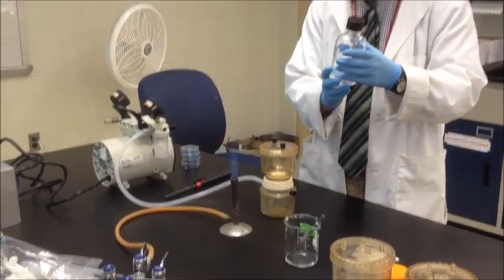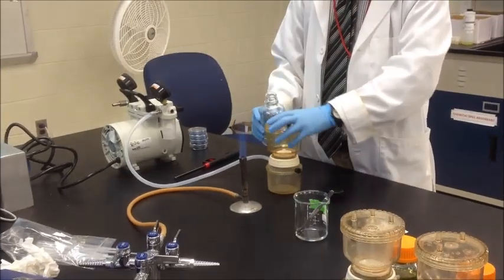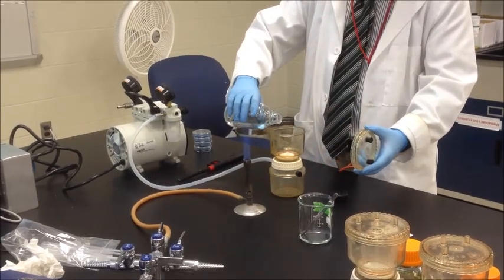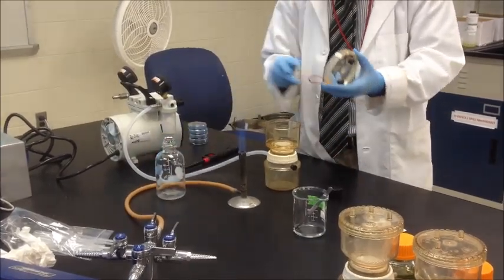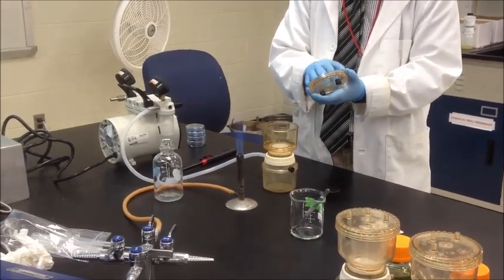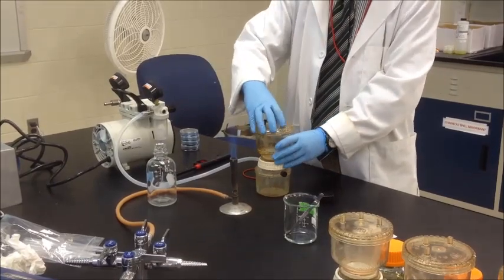And then I'm going to take my water source. This water is sterile water, so it should not contain any bacteria. This will be my negative control. I'm going to open up the container and pour in the water. You're going to be pouring in approximately 100 mLs, depending upon the type of water source, you use different volumes. For our purposes today, we'll stick with 100 mLs, and I've already measured it out for you.